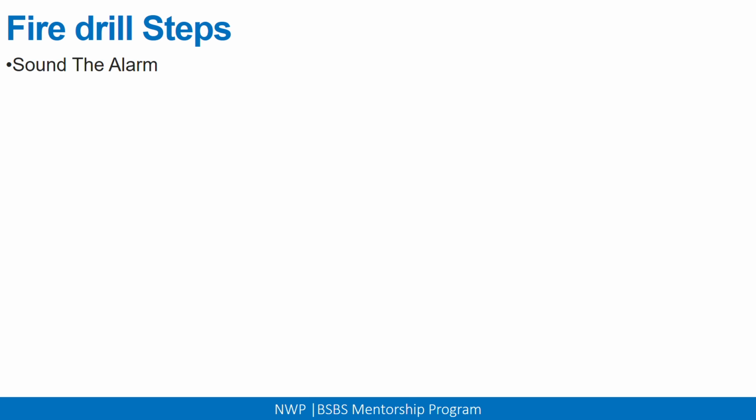If you do not have these, you can use your voice. Even the voice can be an alarm. So you need to shout, whether it's a fire or spill, you just constantly shout out loud to say fire. That way you are sounding the alarm, or you are letting people know of danger around the laboratory.